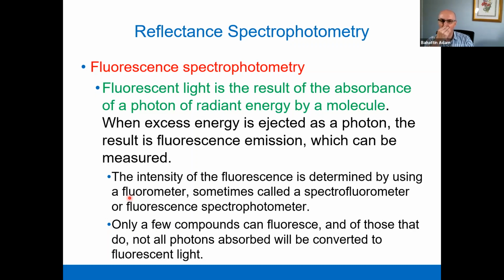If a molecule releases fluorescent light, then you can use a fluorescence spectrophotometer. When excess energy is ejected as a photon, the result is fluorescent emission, which can be measured.